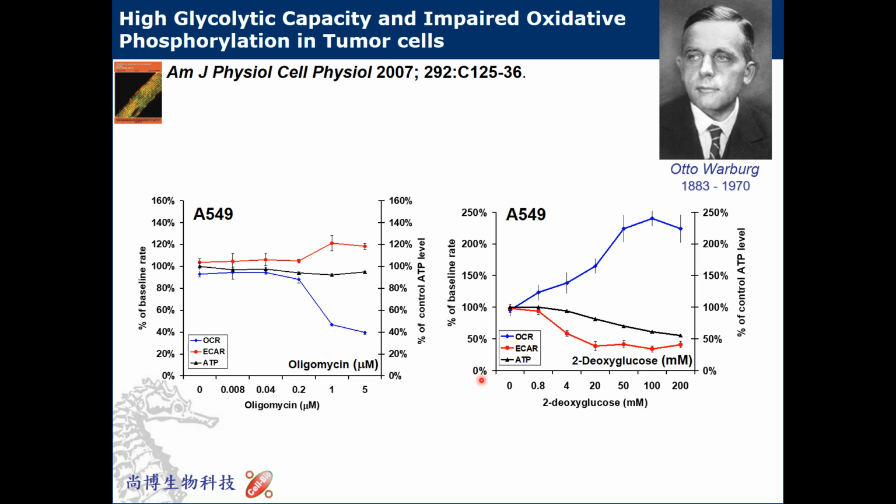First, let's discuss the major application of the Seahorse analyzer. It is about cancer. Cancer is very closely related to cell metabolism. If your lab does research on cancer, you should have heard of the Warburg effect. Let me describe it easily.